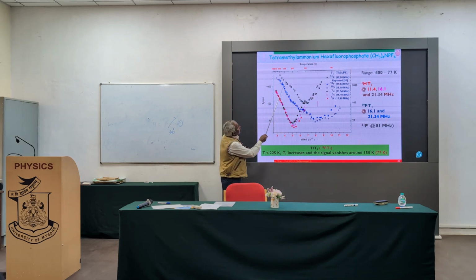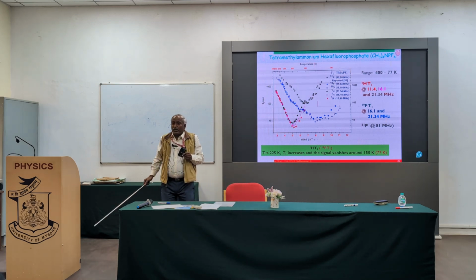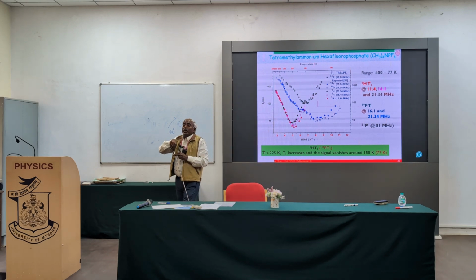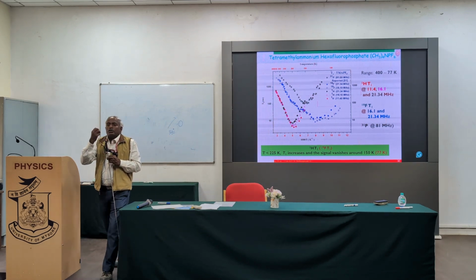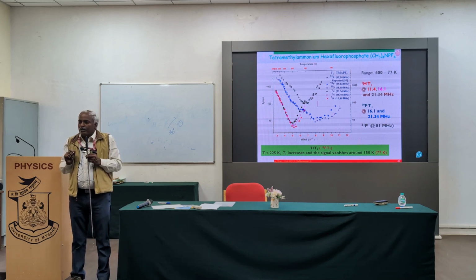That's why, whenever I see this proton NMR, we see it over here. This phosphorus NMR was done by someone else before, in one of the references. Then I did the same compound for the fluorine and for the hydrogen. Again, as I told you, it is up to me to fix the resonance frequency, depending on the magnetic field I am applying.